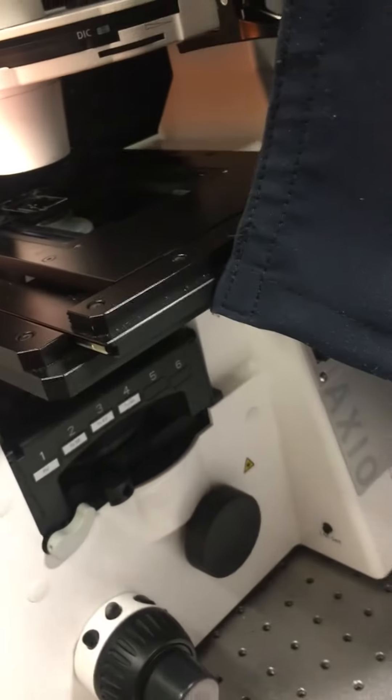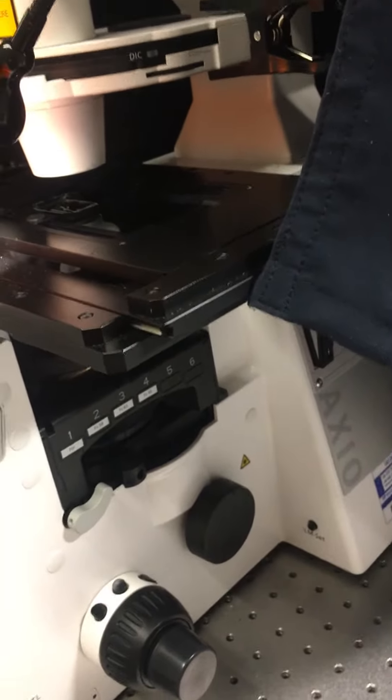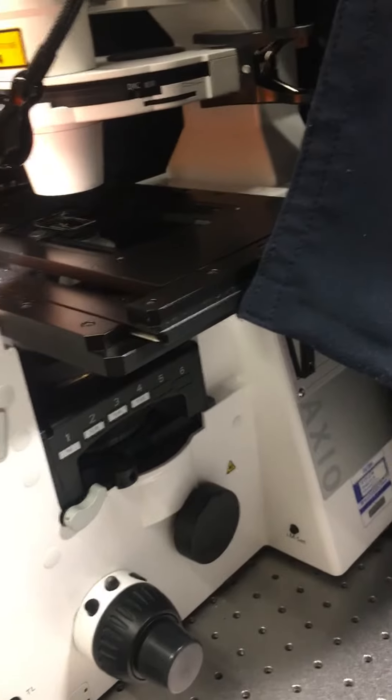And then you also will need an analyzer which is placed somewhere inside of the microscope here, and it's the only component of DIC optics which is controlled from the software.